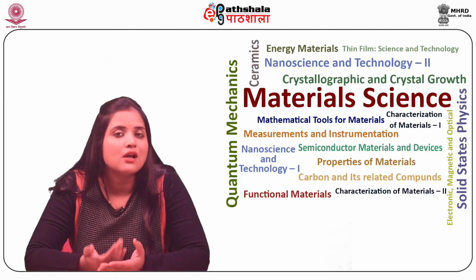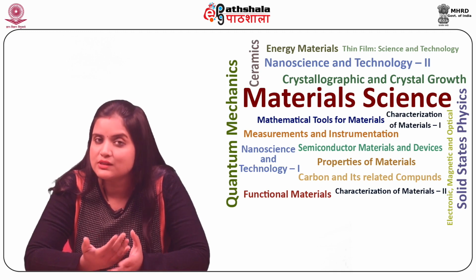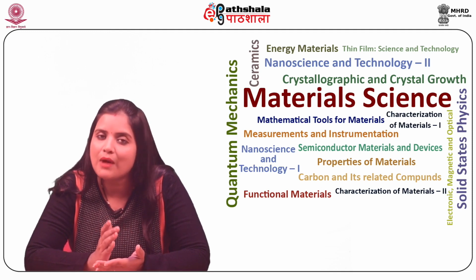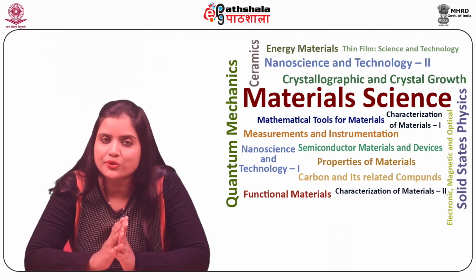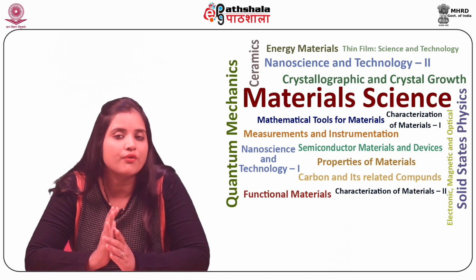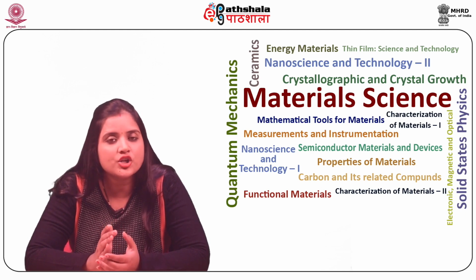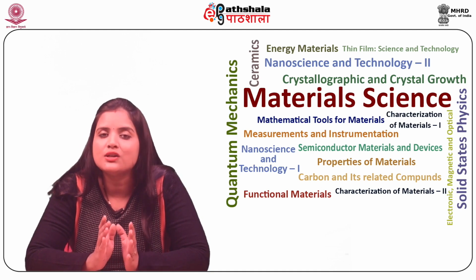Let us discuss digital holographic microscopy, that is DHM. DHM is digital holography which is used in microscopy. It is different from other microscopy techniques which record the projected images of the object. It records the light wavefront information originating from the object as a hologram in digital form.